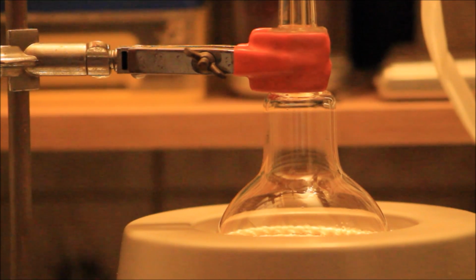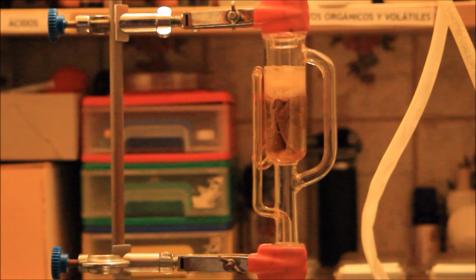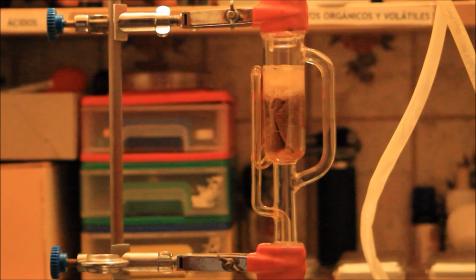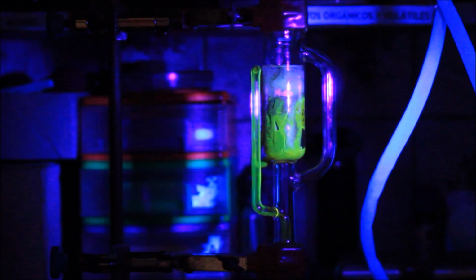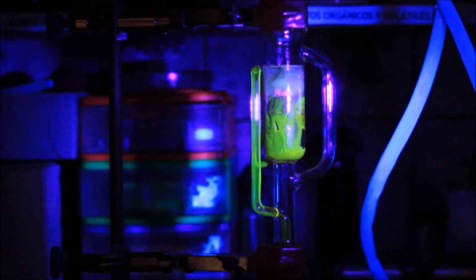Actually, my Soxhlet extractor does not create a complete cycle, but it is constantly dripping on the RB flask. This is due to the position of the siphon. It could be solved by increasing the reflux rate, but it works perfectly fine like this. Sometimes if the cotton is packed too hard, the siphon tube might get blocked and so the liquid does not flow, so it is important to use a minimum amount of cotton.